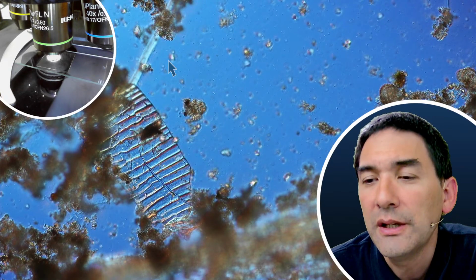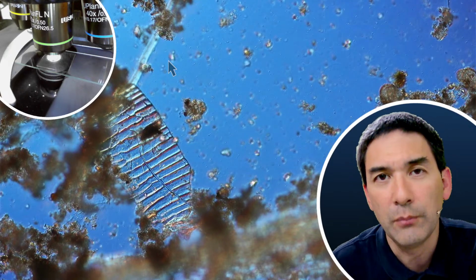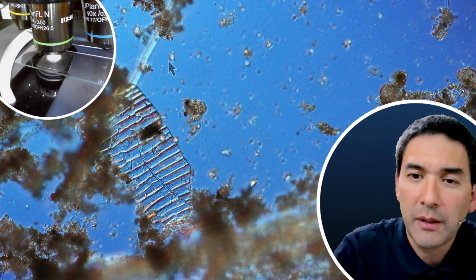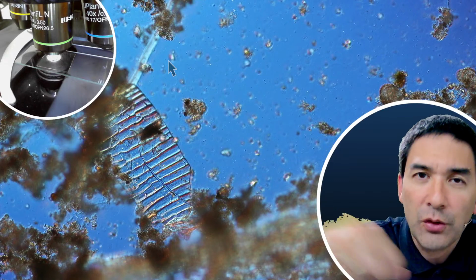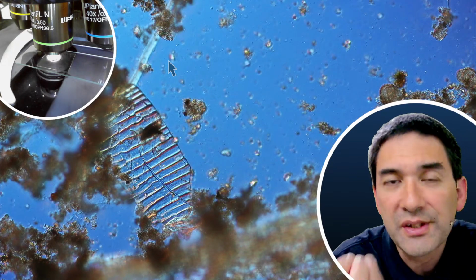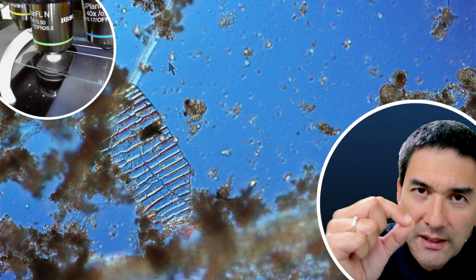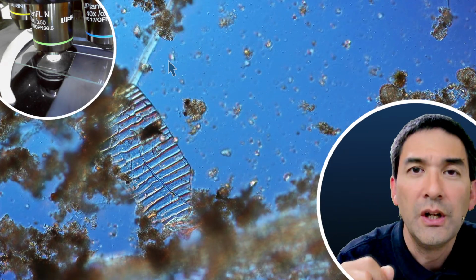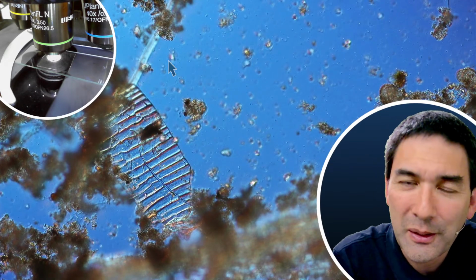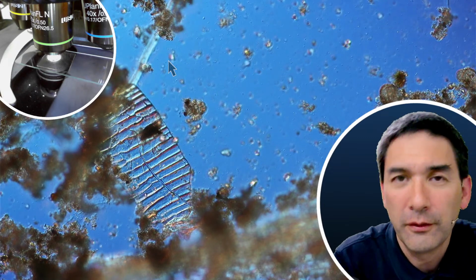Well, what I do is I don't divide the moss sample. I simply take the sample of moss, add some water, turn the moss upside down and shake it out in the water, rinsing off whatever comes off. Then there will be a lot of particles in the water, and I allow it to settle down. Then I take a pipette, take some of the particles that are floating in the water and put it on a microscope slide. So I'm not putting the moss itself directly under the microscope, but the water that was washed off from the moss.